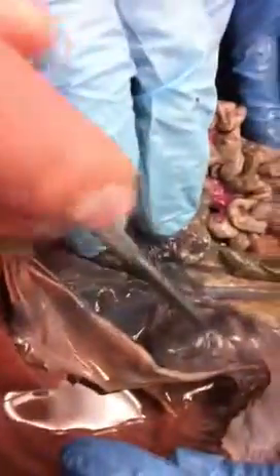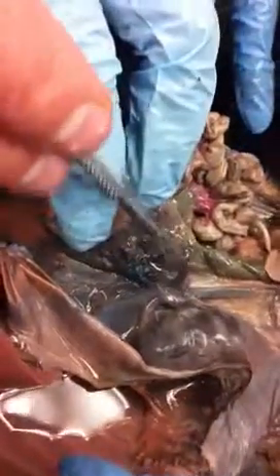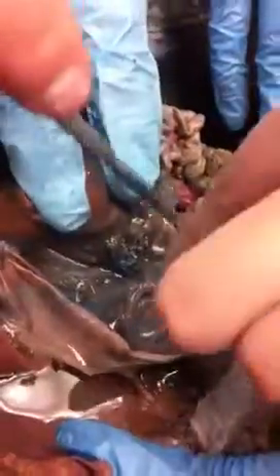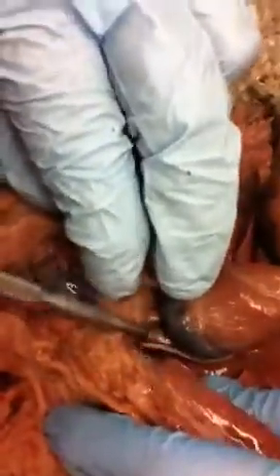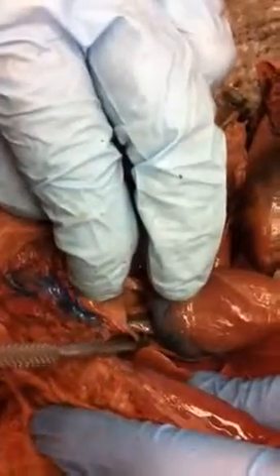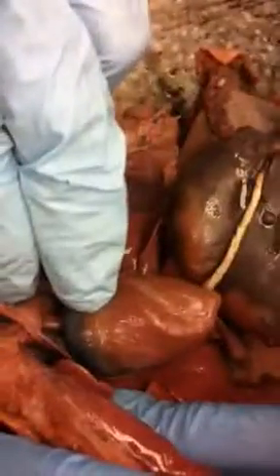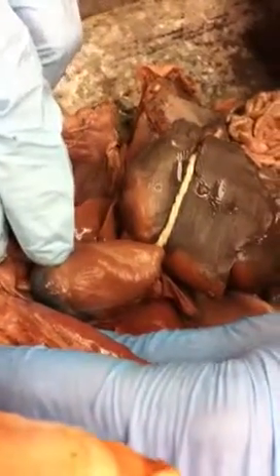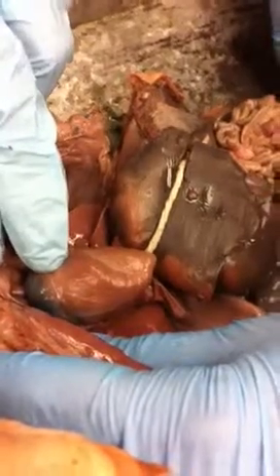Got renal. I don't know if we took a video of the renal. But the renal vein, there's a big blue one coming in, going from the kidney to the inferior vena cava, right? Yep. Yeah, from kidney to inferior vena cava. This one right here. That's the inferior vena cava. Where is the superior vena cava? That's the part up here above the heart. Remember? We already did that one. Right there. Oh, that's the superior vena cava. I thought that's an anterior vena cava. Same thing. Yeah. So anterior, superior, pre, all the same thing. Post, posterior, caudal, all the same thing.